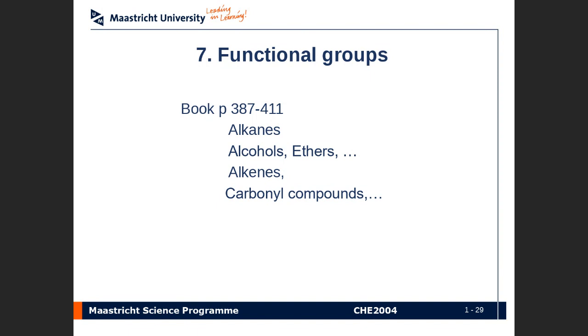So UV-Vis spectroscopy, unlike NMR, which really gives you an in-your-face version of what this thing is that you're analyzing, is something that tells you about the electronic structure, it tells you about electronic transitions, maybe the molecular orbitals, and you can figure out what sort of transitions are taking place. It's very valuable, but it has limited utility in actual structural elucidation. However, it can be used to give some hints as to what class of organic compound you're dealing with, if you know it's an organic compound.